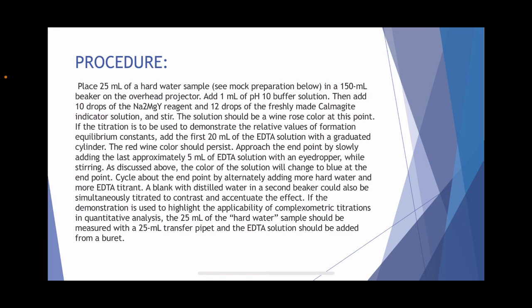If the demonstration is used to highlight the applicability of complexometric titrations in quantitative analysis, the 25 ml of the hard water sample should be measured with a 25 milliliter transfer pipette, and the EDTA solution should be added from a burette.